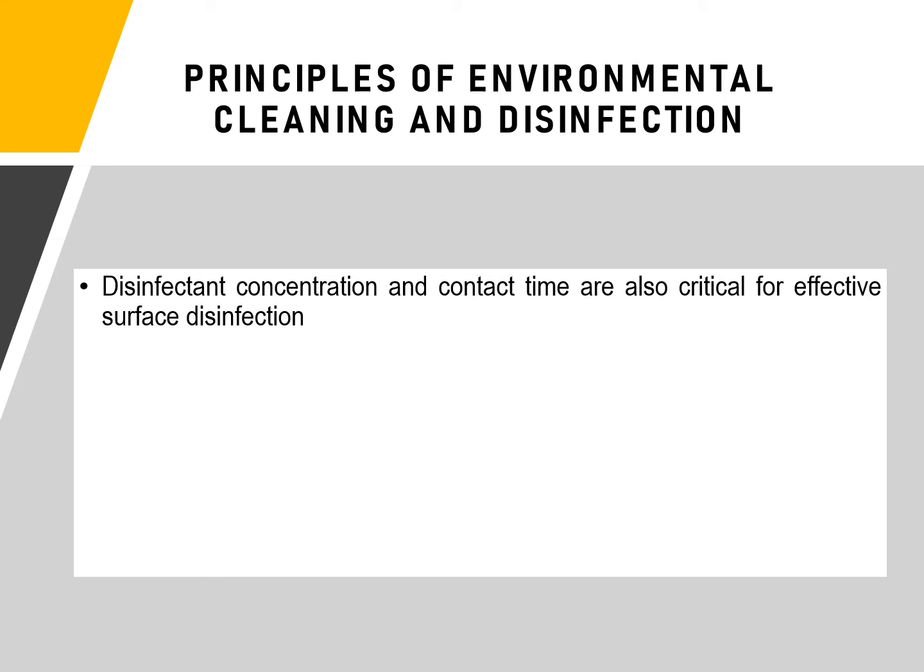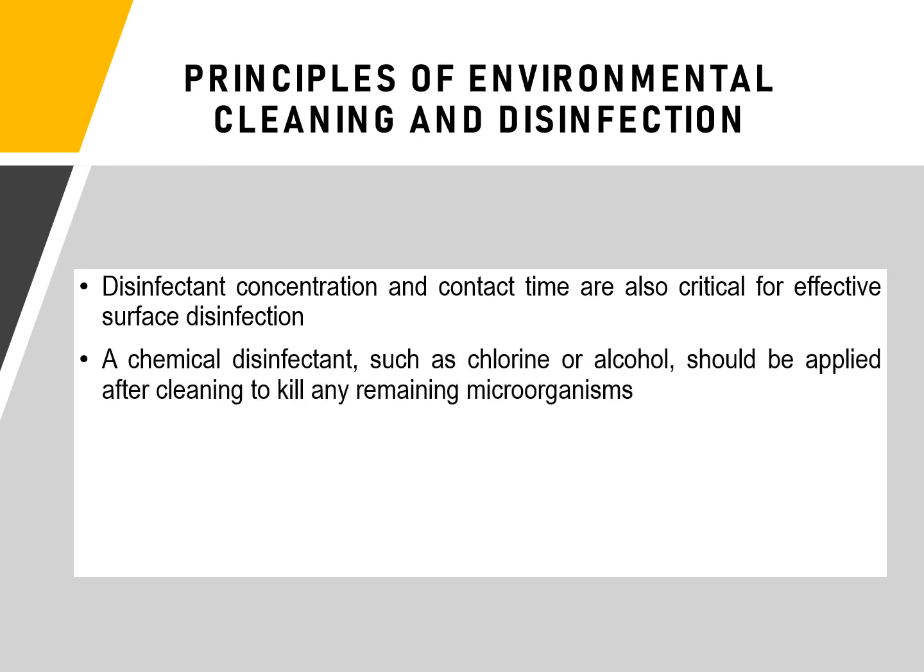Enough disinfectant solution should be applied to allow surfaces to remain wet and untouched long enough for the disinfectant to inactivate the pathogens as recommended by the manufacturer. A chemical disinfectant such as chlorine or alcohol should be applied after cleaning to kill any remaining microorganisms.